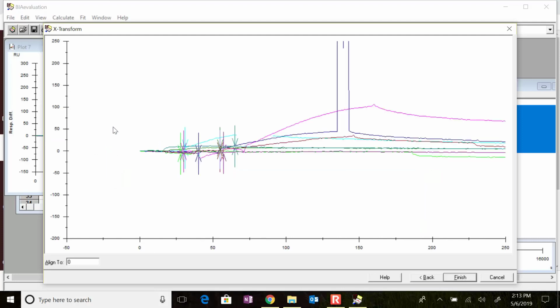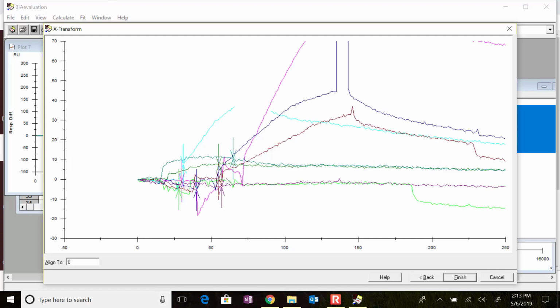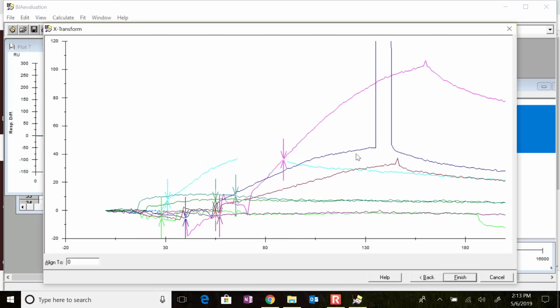where I can look at this, and it's kind of a mess because we do actually have a lot of data here. But what I want to do is try to put these all on the exact same point in the curve. Now actually the best point in the curve to use, I'm going to double click to zoom out because I want to include this point. There we are. Okay. I want to try to align it to the top of the shark fin.